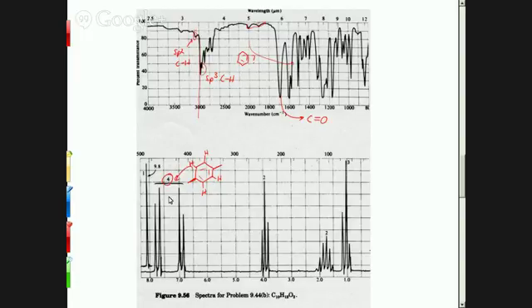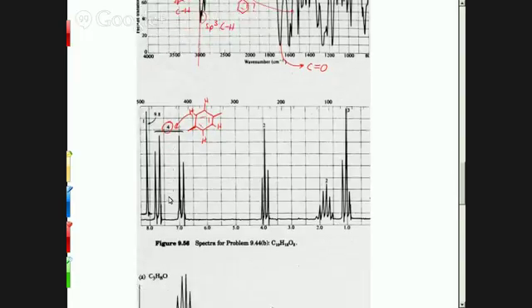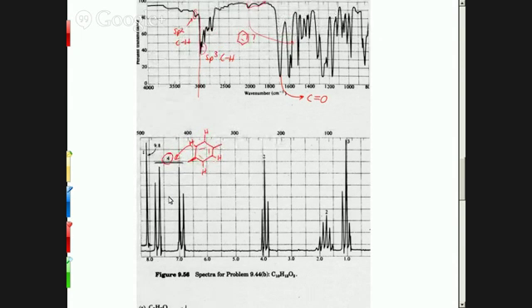All right, so we found one piece. Let's start looking for some other pieces. If you have this nice doublet like that, that nice splitting, that usually means that they're across from each other. And if it's messier, it means they're not across from each other, either right next to each other or one away. If you go on and take more organic chemistry, you'll get into how you figure that out. We won't do that in this class.